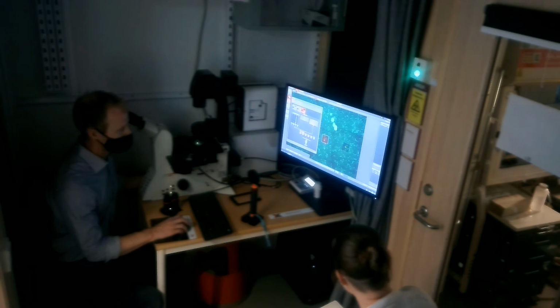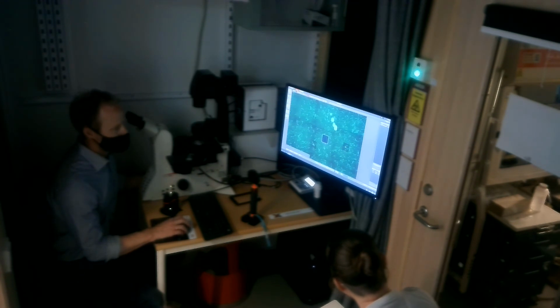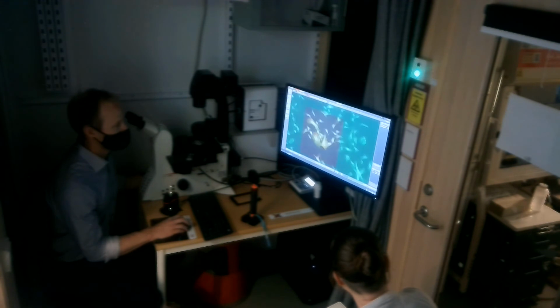Now we're live, so we can also see it here. You can adjust these so that everything looks okay. You can check the exposure time just as before. And once we are done here, I can go start. The start button is over here. So starting this, then it will go and run everything in the task list. So it was these two. So now we can see it captured this, and it captured this.